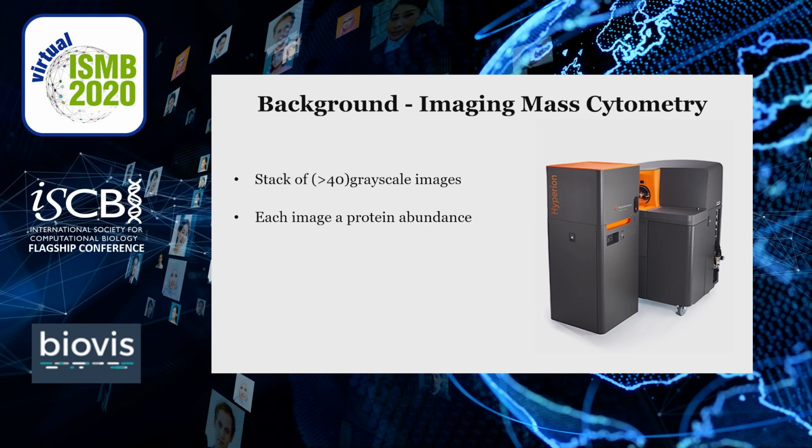novel imaging modality, imaging mass cytometry, which provides a stack of more than 40 grayscale images at subcellular resolution, where each image illustrates the abundance of a specific protein in the tissue. The combination of these proteins defines the phenotypes of the cells. To get the cells, firstly, the images need to be segmented in a pre-processing step. Input to our workflow are these segmented images.